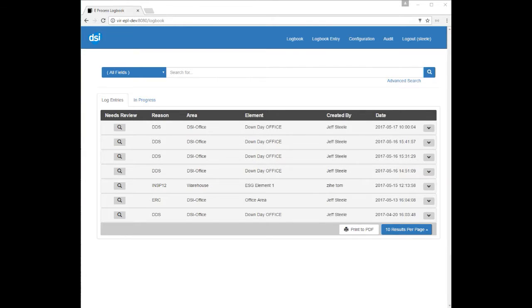Okay, so we're going to talk about elements in this video. Elements are really the basic building block of the EPLuA system. When we first started this, we started out with the word equipment, and then equipment quickly got outpaced because there are other objects within a facility that people would like to do logbook entries against, maybe a room or a process.